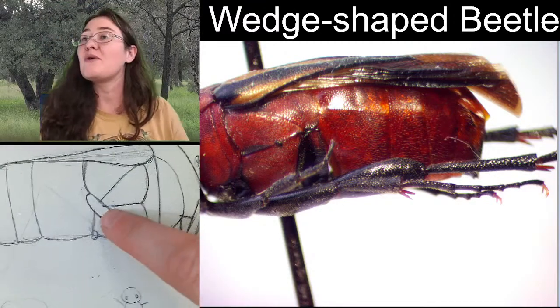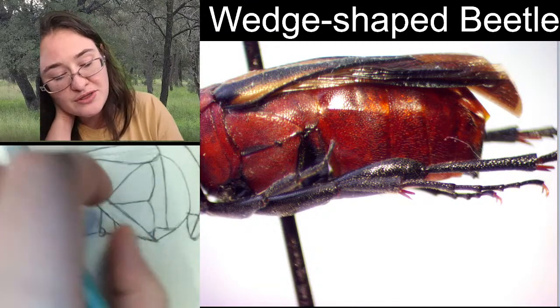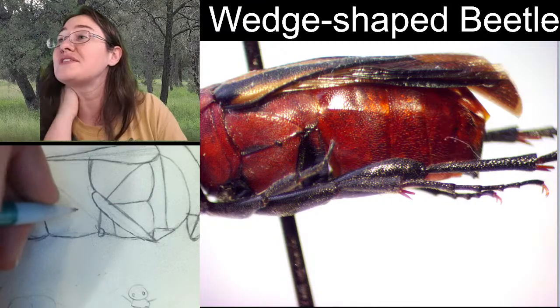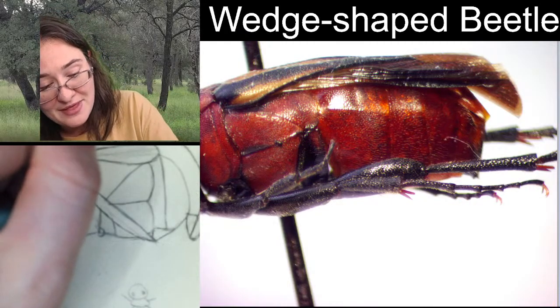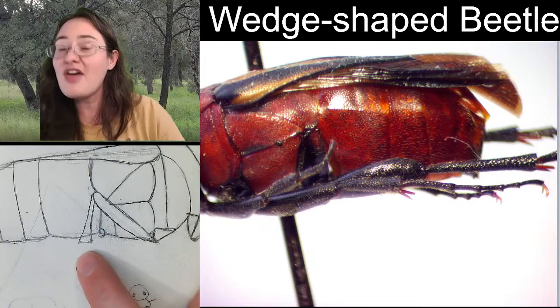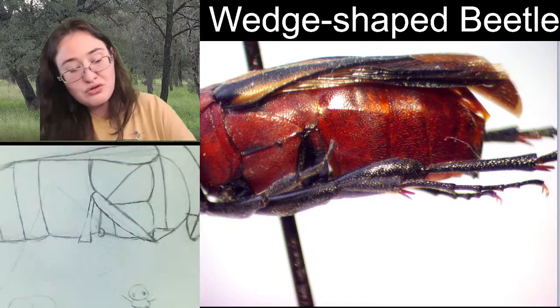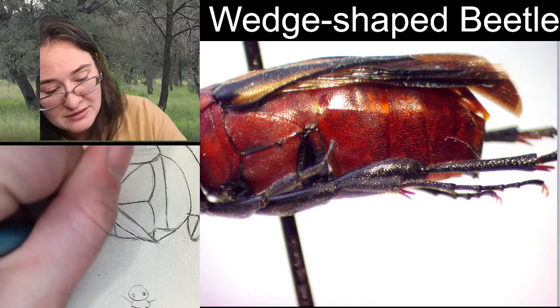All right, so we have a femur here, and then our tibia is going to be a little bit shorter than that. So you can take that and move it down. Your tibia is going to be nice and narrow at the top, and then it's going to flare out or get wider at the base. And then you get those two tibial spines.